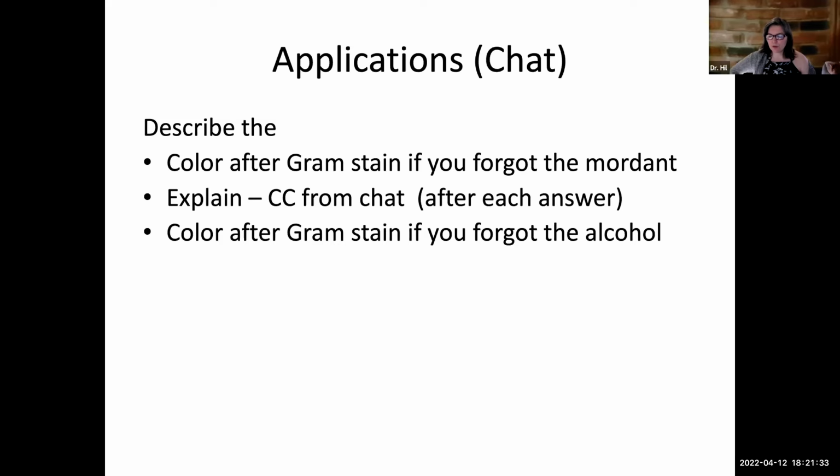Tell us if you know why you chose that answer. It's also fine if you just guessed, but if you didn't just guess, if you have an actual reason for choosing that, tell us what it was by raising your hand. Megan, go ahead. The alcohol is the decolorizing solution, which removes the purple color from the gram-negative cells. Yeah, exactly. So the whole purpose of the alcohol is it washes the purple out of the gram-negatives. It doesn't wash them out of the gram-positives. We'll see why that is when we get to our structures.